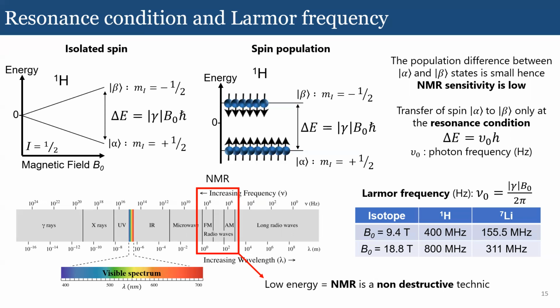That's what you would have, for example, with infrared spectroscopy. So when you are doing spectroscopy, you are playing with these energy levels, no matter what they are. And when you are doing NMR, the energy levels that you are using are the ones produced by the splitting of the nuclear spin states, so the alpha and beta.